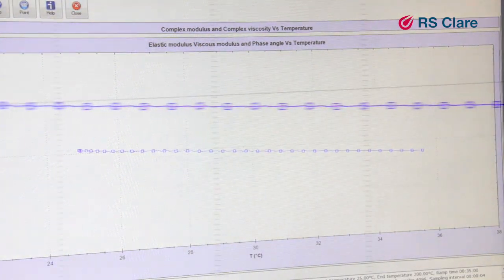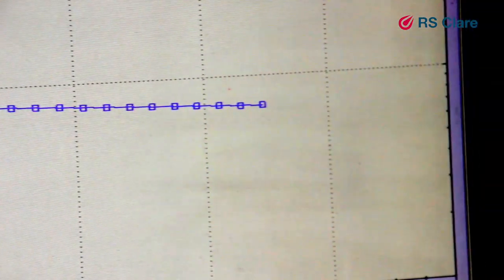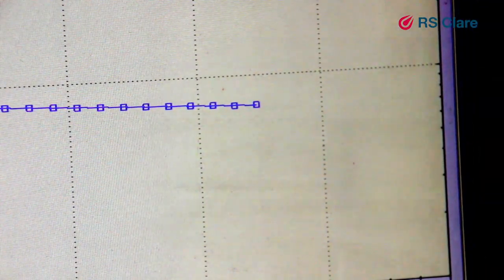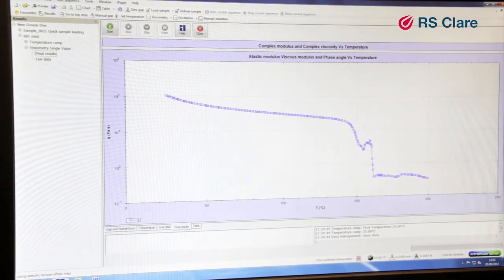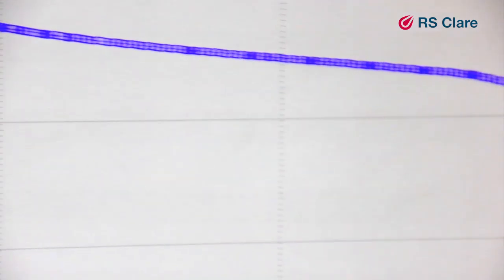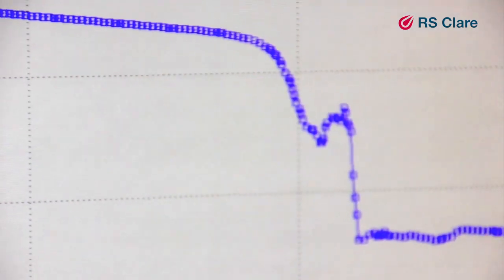The amount of force required to turn the cone is measured. This allows the grease's viscosity to be calculated. Data points are quickly gathered. A graph of viscosity between 25°C and 200°C will eventually be created.